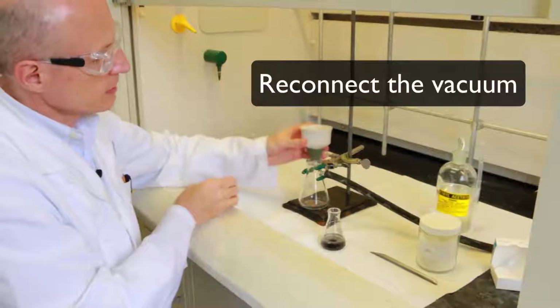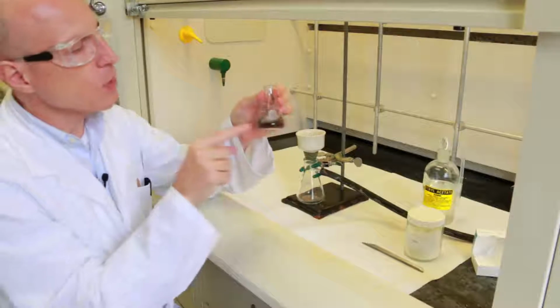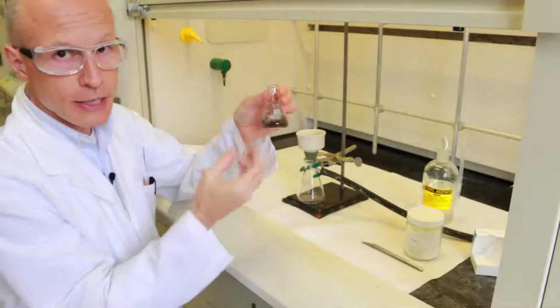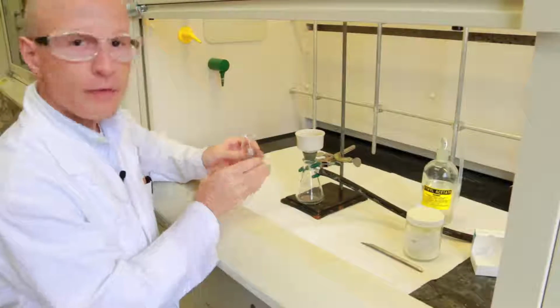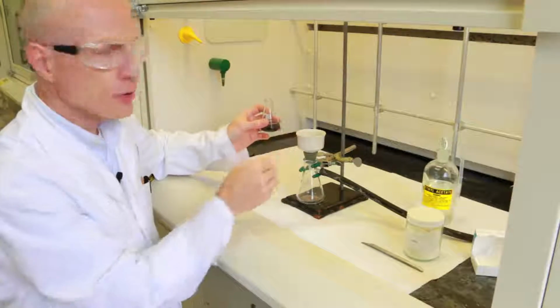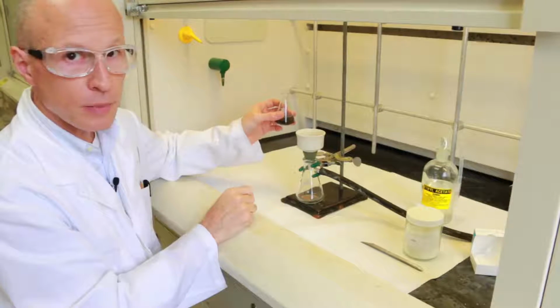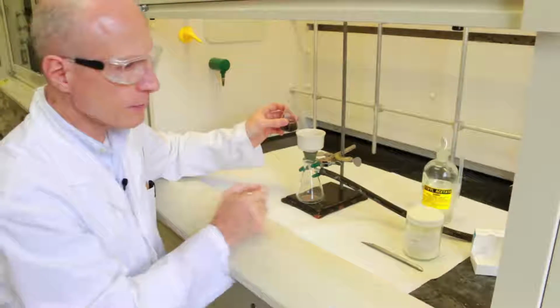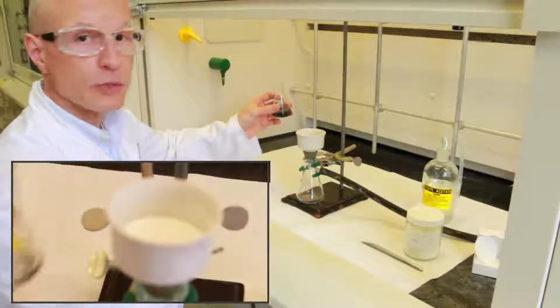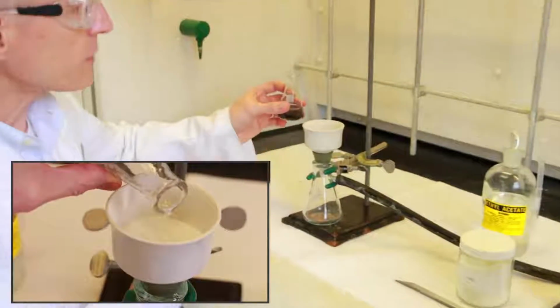You can put the funnel back, and in this case you want the filtrate, that is the liquid. You just want to get rid of the solid that will become waste. When you filter through Celite, it's very important not to disturb the surface of the Celite, so you don't want to dig divots while you are pouring your solution. You can either pour very carefully and very slowly, or you can add a second piece of filter paper on top so it will break the fall and you won't dig divots into the surface of the Celite.